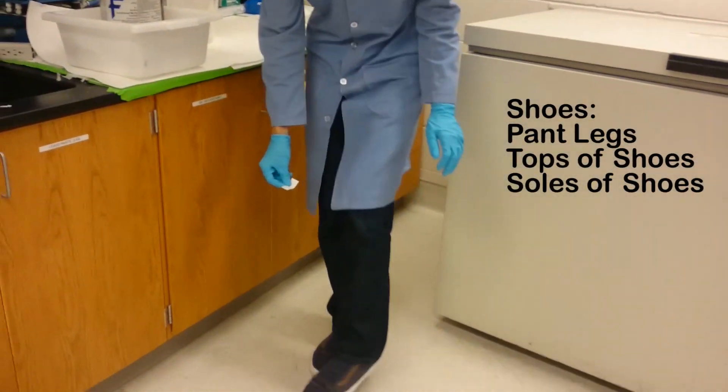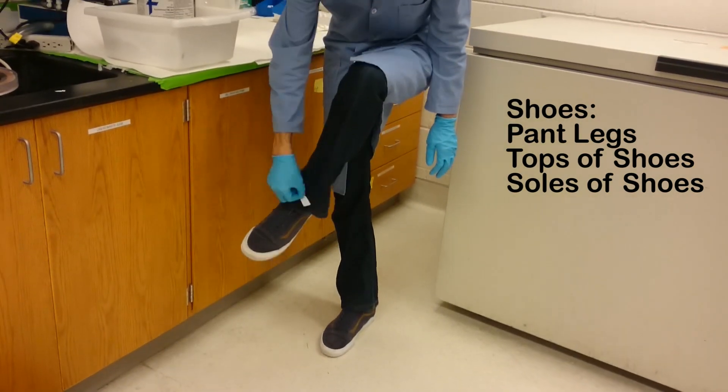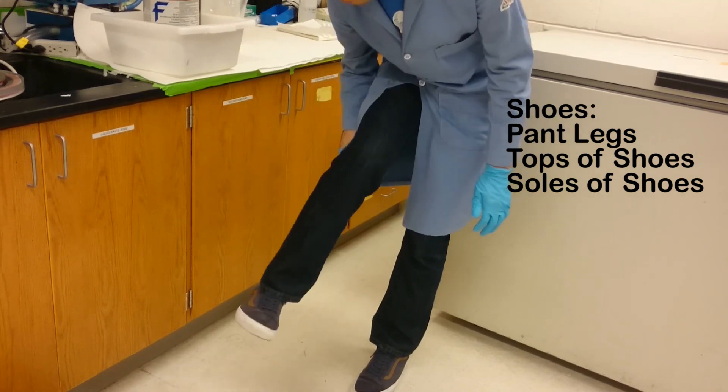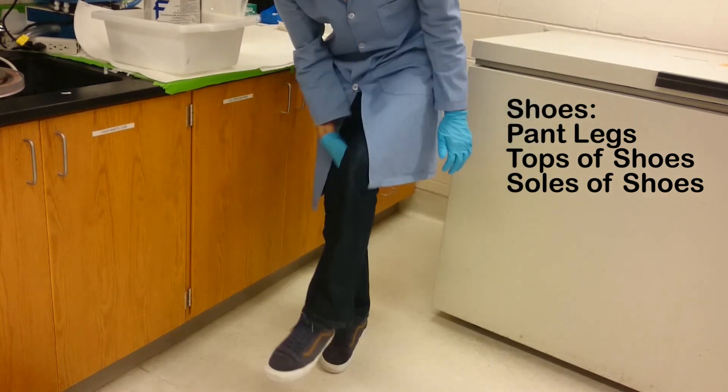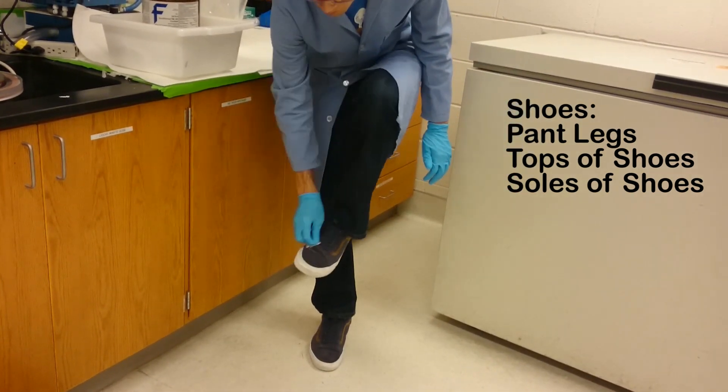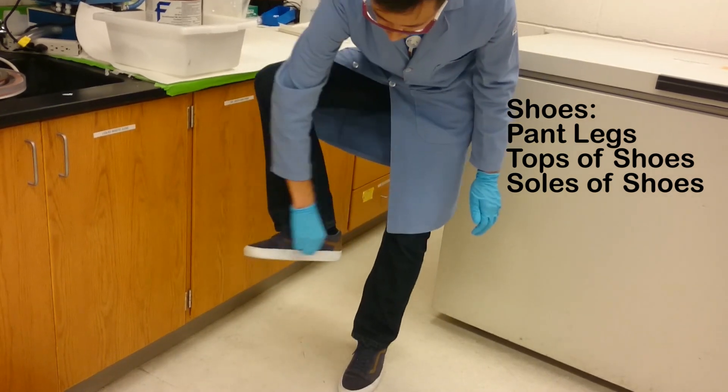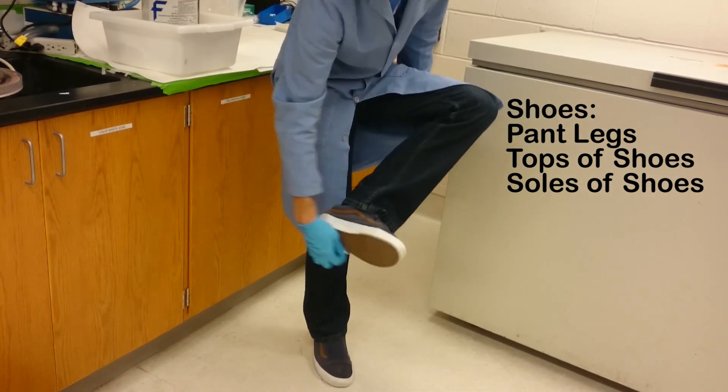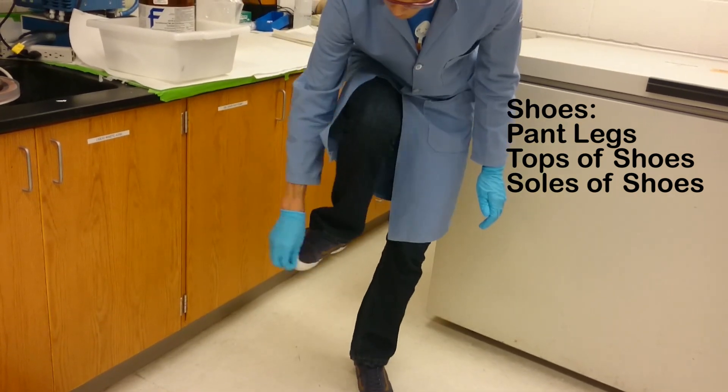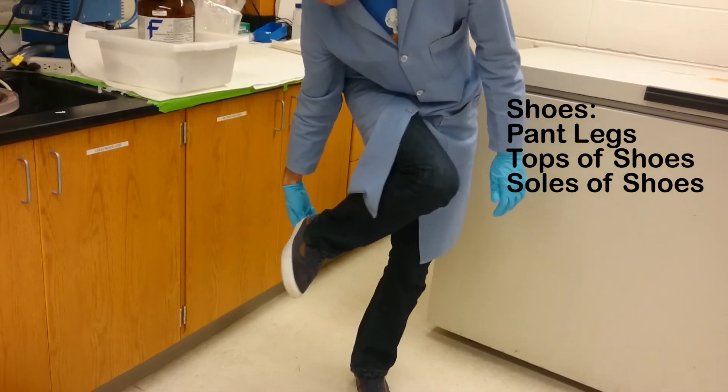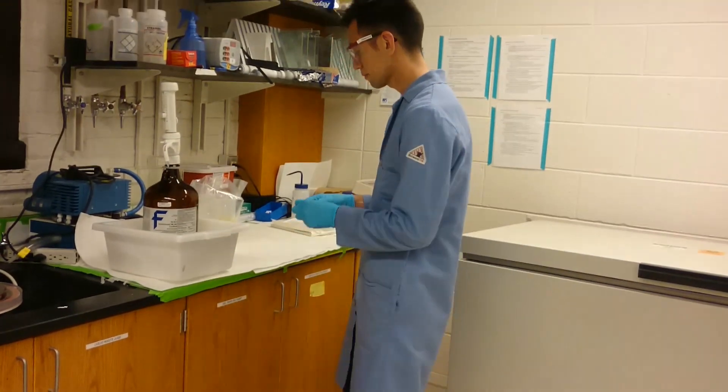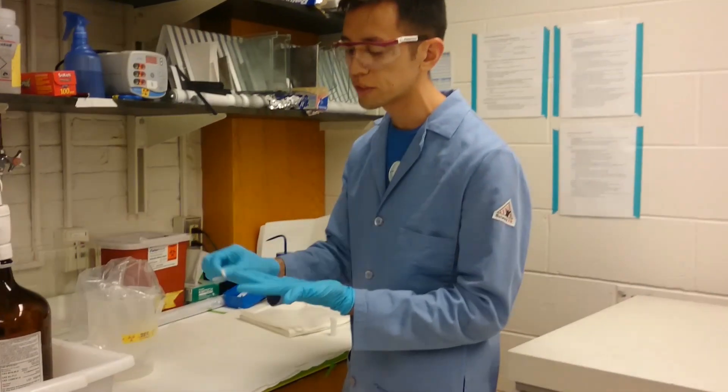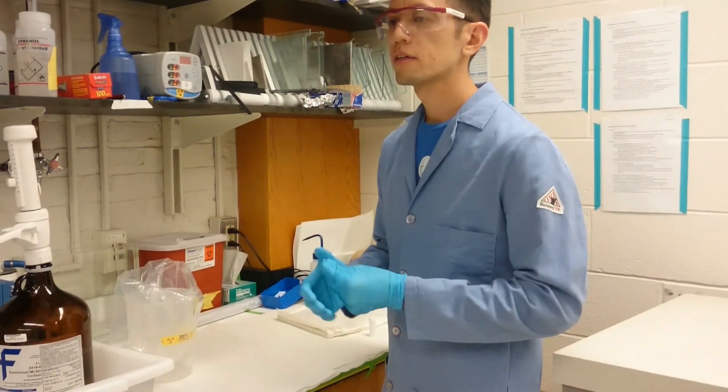Now I'm going to swipe my pants - the front of my pant legs, the back of my pant legs, the tops of my shoes, as well as the sole of my shoes. At this point you can also do your gloves. You want to check your fingers, as well as the palms.